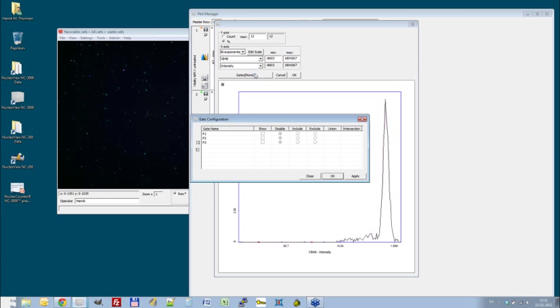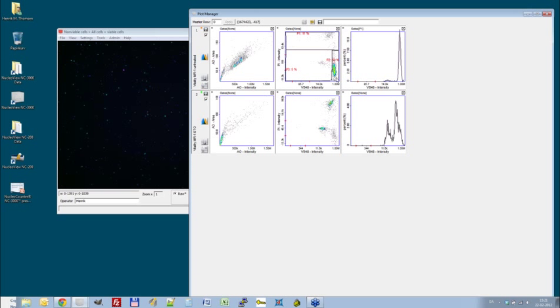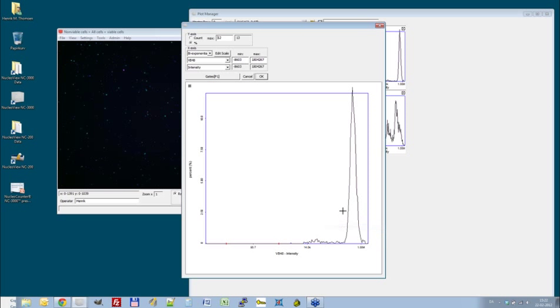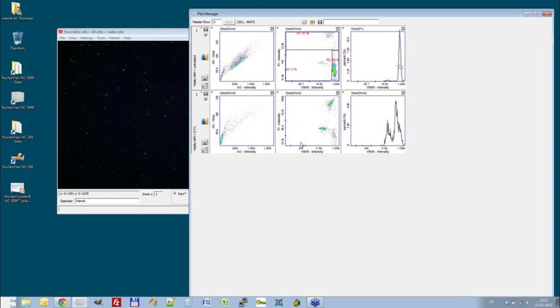If we then on this histogram here choose to gate and show only our live cells, that means excluding our dead cells, we can get a peak showing this population, the big peak, and the little peak showing this population out here. And by putting in a marker, we can get the percentage of live healthy cells out of all live cells. That means 94% of all live cells are healthy.